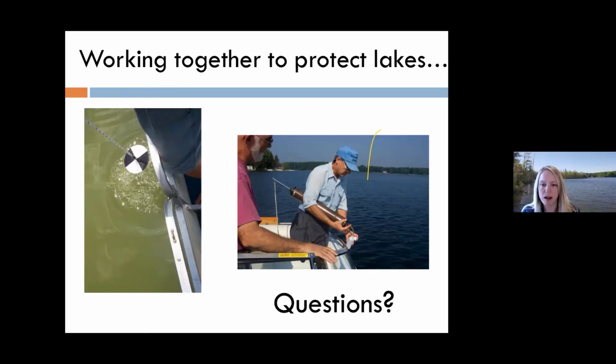That's great advice, Paul. And another thing I'll mention along those lines is that there is a place on your data forms where you can note any unusual conditions. So if anything unusual is occurring on your lake at the time you take that sample, you can put that on there so you remember. You may say there was an algae bloom visibly happening, or there was a lake treatment that occurred 2 days before. You can make that note.